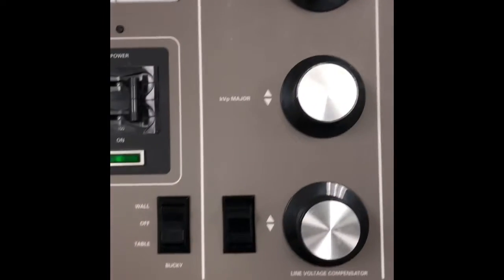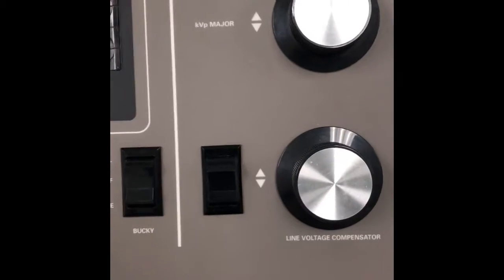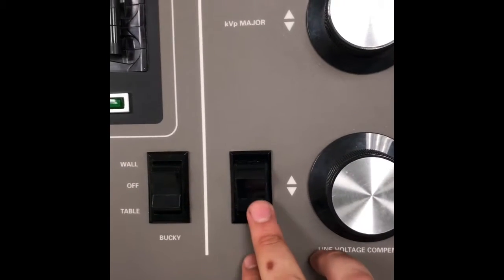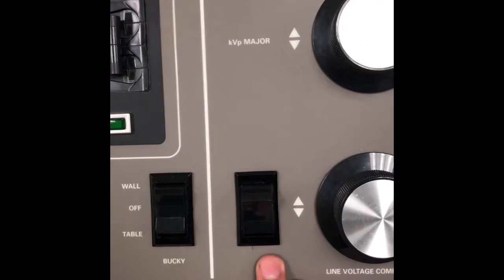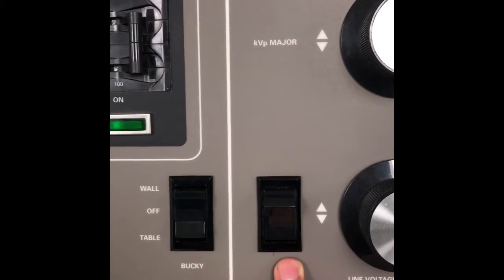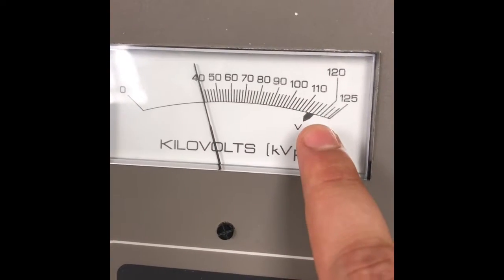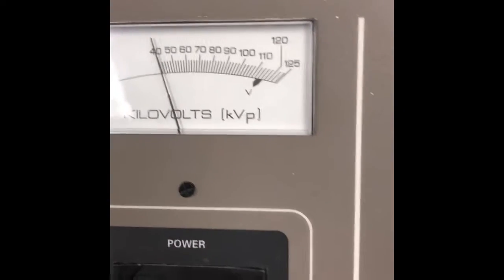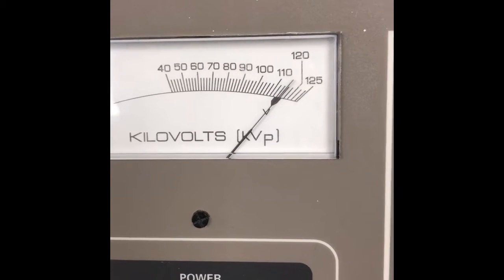Okay. And also, you can see here we have the line voltage compensator, which is this little button right here. And when I flip this, it should show me that it's maintaining a constant voltage and current, which will push this all the way to this little red thing right here, and it should land right on it. So let's see. There you go.